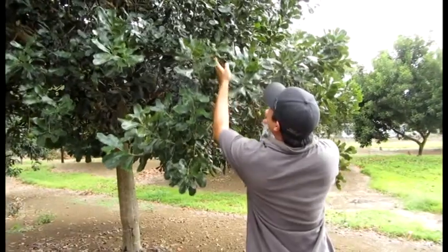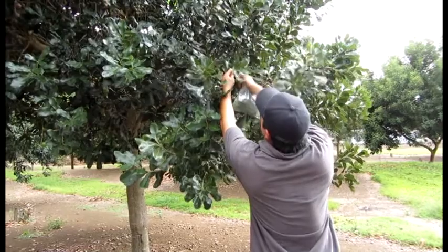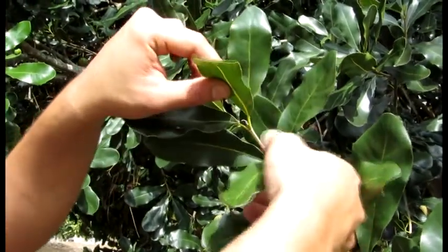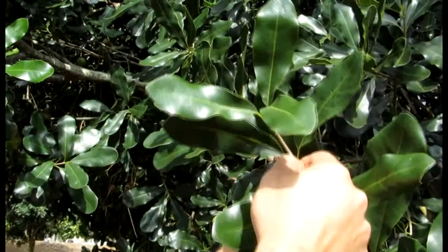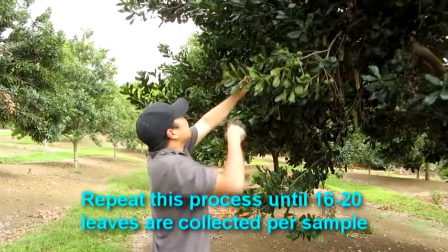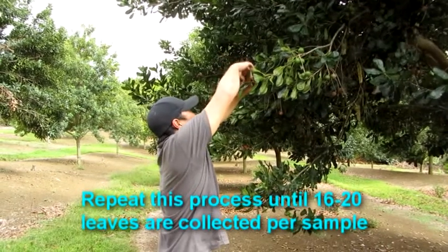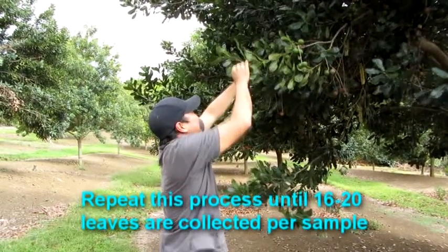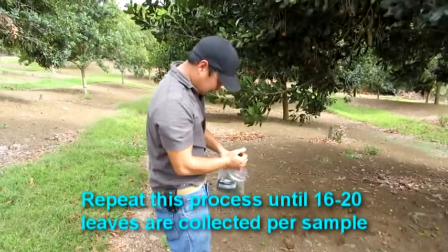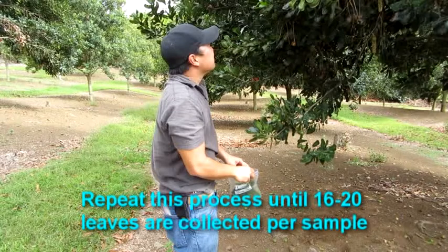Locate a branch that is reachable or about mid-height of the tree. Now locate the second row of leaves below the tip and remove one of the leaves and put it in the bag. Repeat this process until 16 to 20 leaves are collected for each sample if doing an individual sample. If doing a composite sample, tag and sample five to six trees, taking just three to four leaves per tree and combine all the leaves into one sample bag.